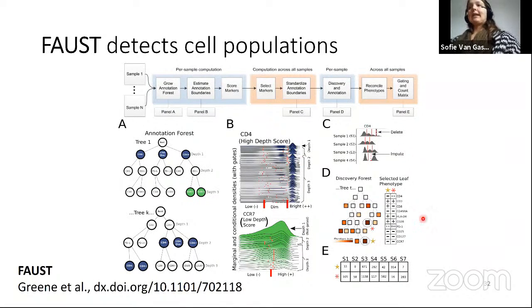And then in the end, they also have the step where once they have the clusters, they will look at what is now occurring across multiple of the samples. And in the end, you also end up with this kind of matrix like I was showing before.